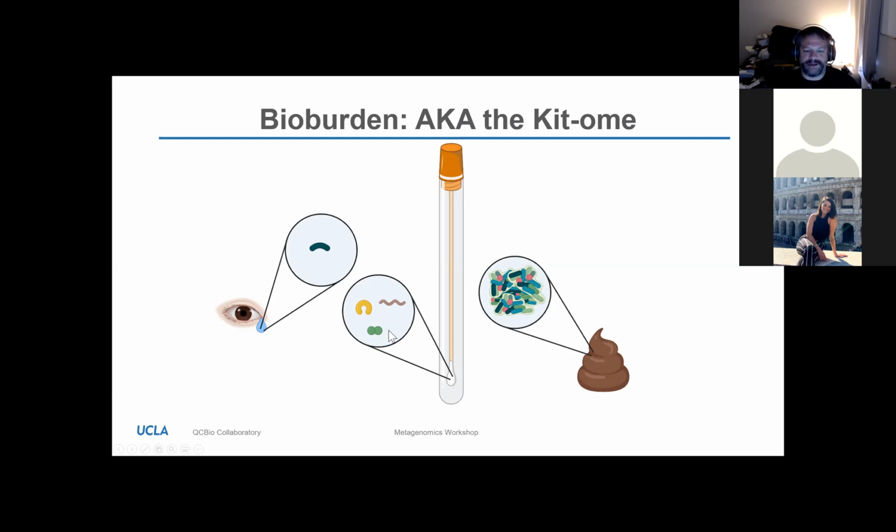All right, so anyway, you can have microbes living on your swabs. You can also have microbes living on your beads, and I can tell you that the ceramics or whatever other material suppliers, or the glass suppliers that supply beads, don't necessarily clean those beads. And a lot of times those beads can actually come in even dirty. Sometimes they come in even visibly with crud on them.